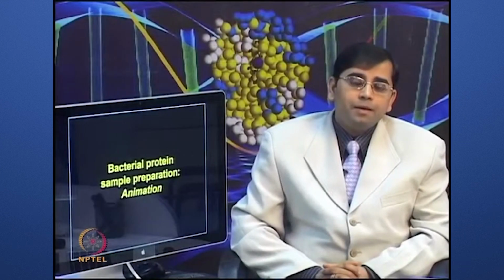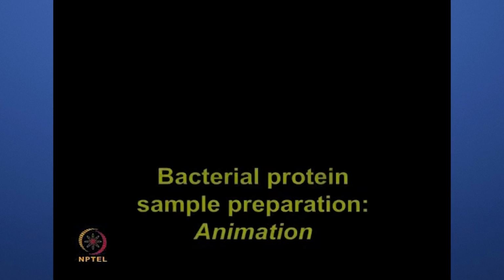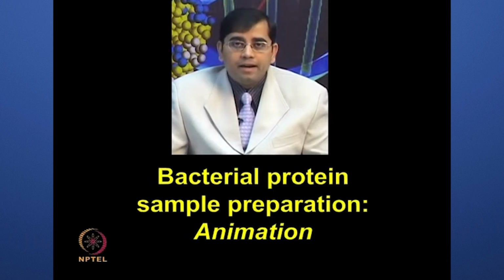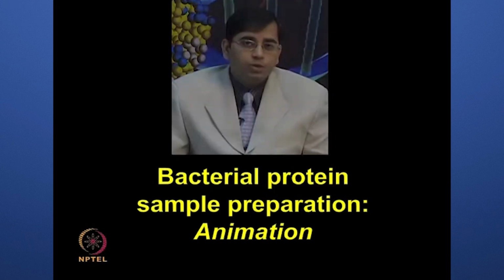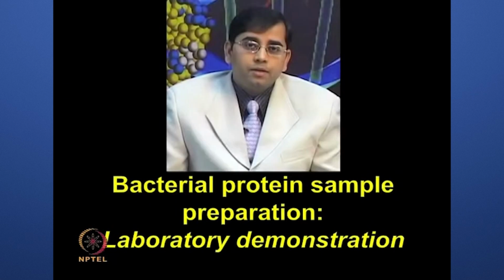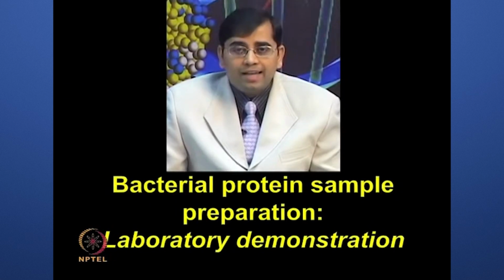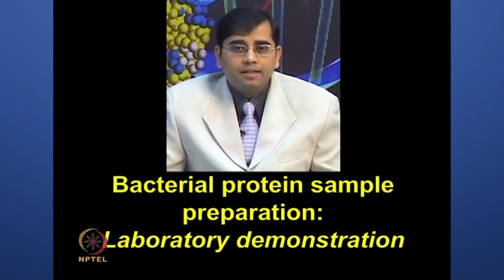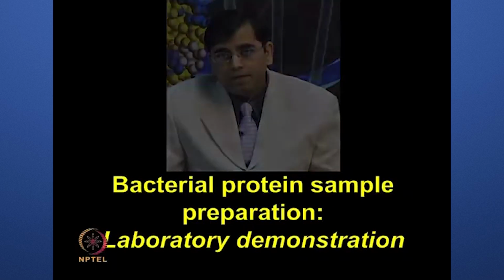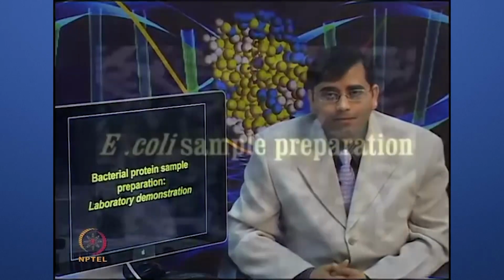Okay. So, I hope this animation was informative. Bacterial protein extraction by using the trizol method, and you must appreciate that in this method you can obtain RNA, DNA and protein, all the biomolecules together. So, to give you further information about the detailed protocol as well as how to perform these experiments in the lab, I will show you a video for the laboratory demonstration of bacterial protein sample preparation for proteomics applications. So, let us watch this video.